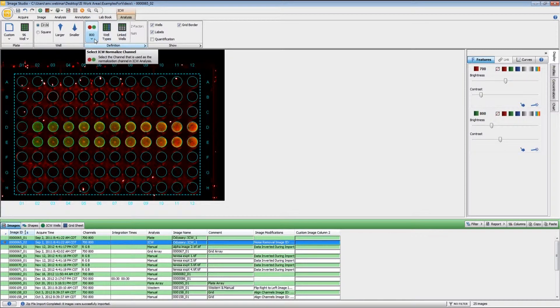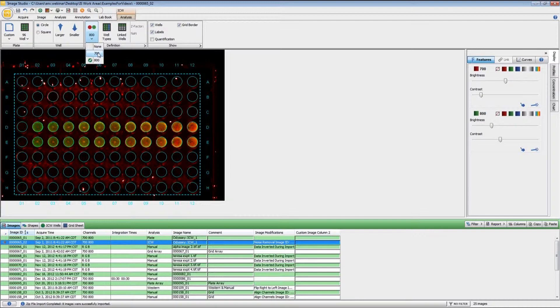For the analysis, what you need to do is to first set which wavelength has your normalization channel. For this particular image, I have the normalization in the 800 channel. If you have used one of our InCel Western kits, the stain will be in the 700 channel, so that's what you would use for normalization. But for this one, it is in the 800 channel.